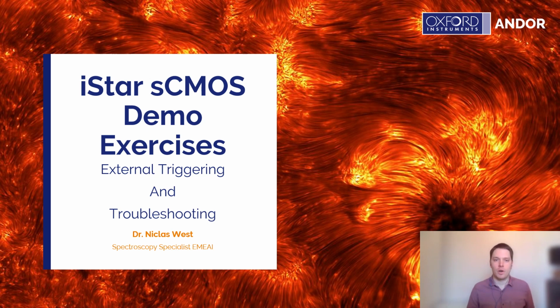And in today's video on iStar sCMOS cameras, I'm going to go through some demos and a bit of background information on standard external triggering practices and how to troubleshoot them as well. So I plan to approach this from giving very beginner introductory level information, but then in some instances I go on to very advanced content gradually. So I hope that both beginners and more advanced users will be able to take something out of this video.